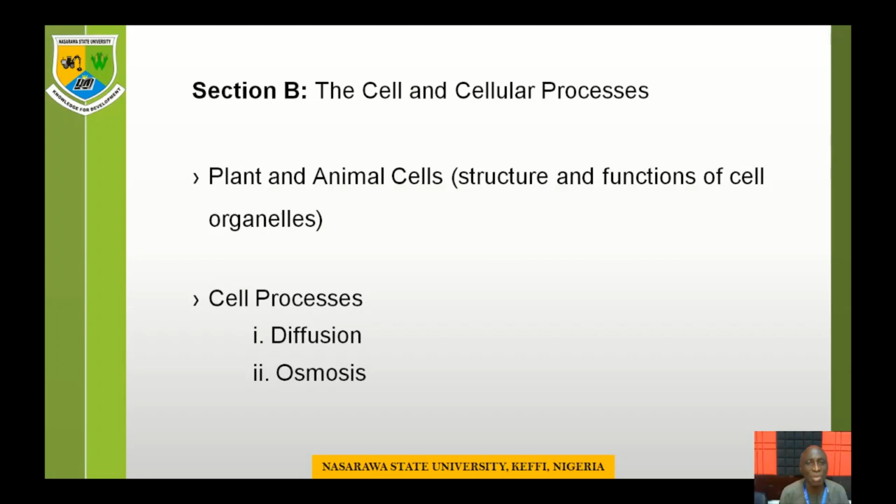It will be important when we are required to draw a cell, we should be careful. There are rules guiding drawings. Sharp lines, clear objects, no shading, all the rules are there. And so, when we are asked to look at functions, carefully, every organelle has a function. So we'll be looking at all that under this structure and function of the cell.